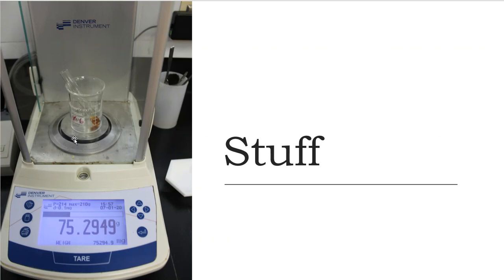So this will allow me to calculate the amount of product that I have yielded. I thought this was a better way than running the chance of scorching my product, because these alcohols have a boiling point of 140 to 160 or higher. Folks, I don't want to heat my boiling flask up that hot. I just don't trust it, right? It's like putting cookies in the oven only to end up burning them in the very end. Who wants to eat burnt, nasty, stale cookies? Not me. We're going to throw them in the trash. And that's what I would have had to do here if I did not do the boiling point alternative that I'm getting ready to show you.